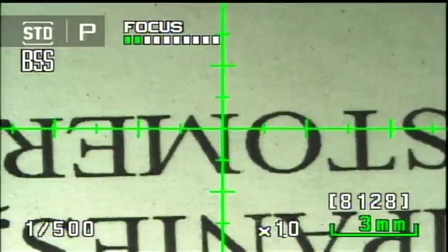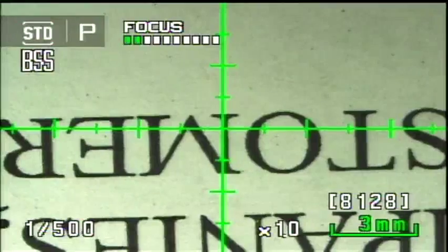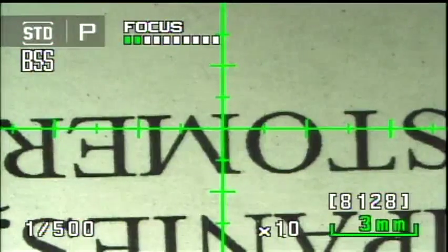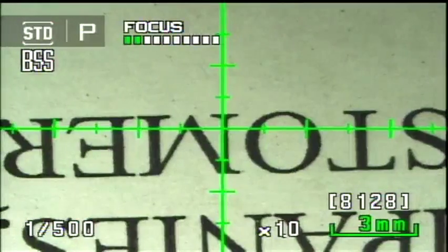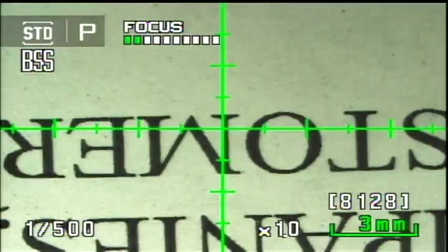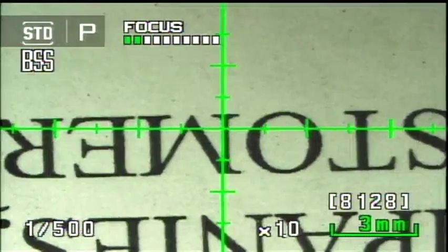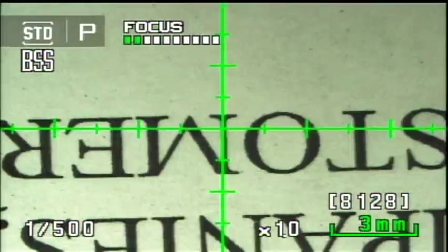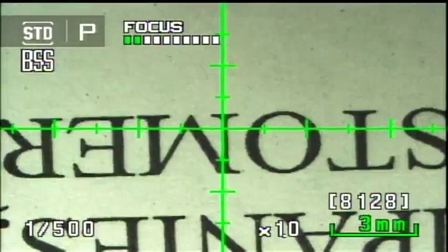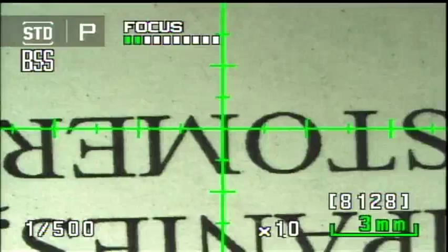If I want to take measurements, there's a scale displayed on the screen. The Shuttlepix comes with several different scales — you can use a crosshair or turn the scale off completely. In the lower right corner it shows the scale resolution. At 1x, each large tick on the scale is 3 millimeters and each smaller tick is 1.5 millimeters.